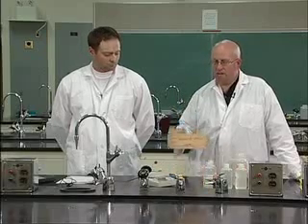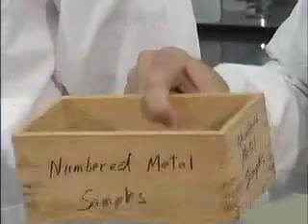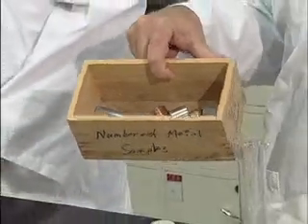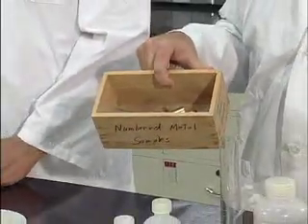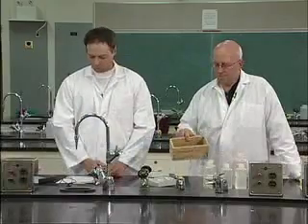We have a box there, and in the lab you'll see this box, and Scott's put in here a bunch of different solids, and what we want to do is figure out the density of each one of those. And again, we talked about the definition of density before, and it's in your lab handout too.